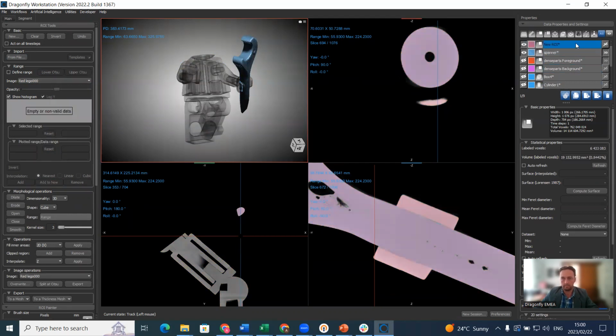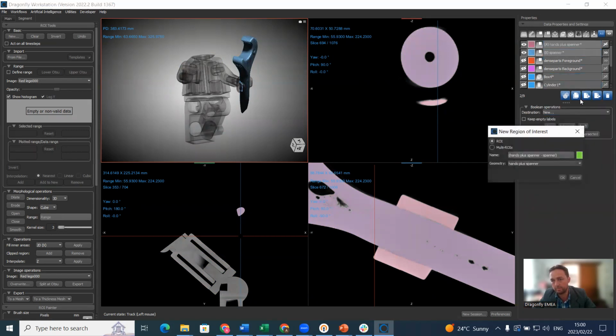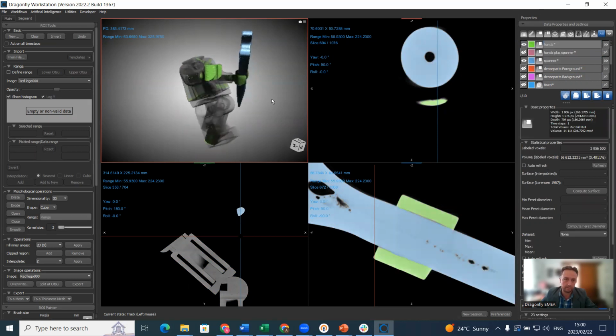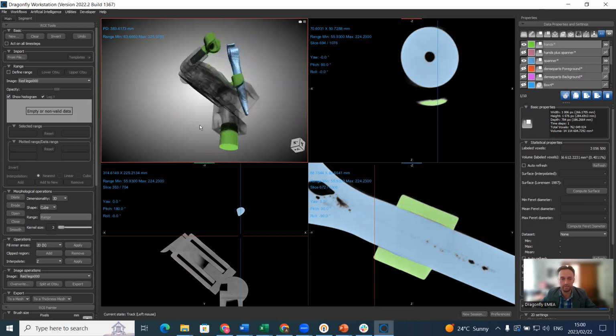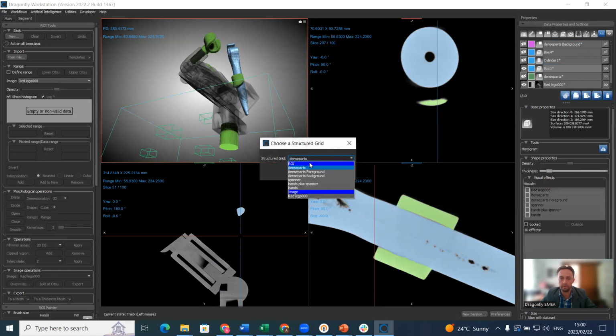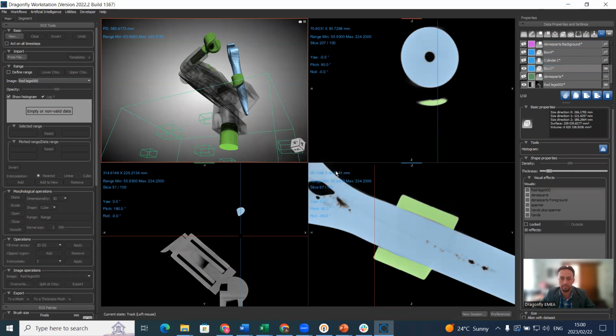So now if we take, let's just call it hands plus spanner. If we do that minus that, A minus B, that would be just hands. So now we have the hands as 2 parts. Actually, there's something to be removed down there, so you can use again the box. Where's the other box, the first box? So we can remove from the hands this part, right click on the box, remove from hands. There we go.